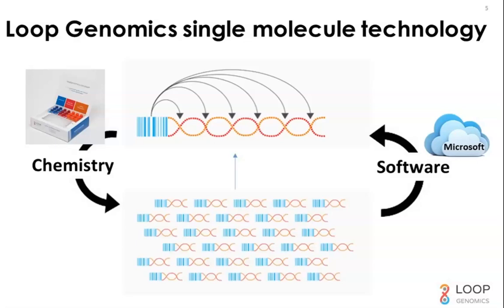Nick, do you have any suggestions as to how to minimize the false positives on the V3 and V4 analysis? Yeah, that's a good question. There are a bunch of different ways of doing this. Kind of informatically, and we actually do a bunch of false positive reduction informatically. So we'll eliminate what we think are spurious near neighbor sequences that are mismapping.